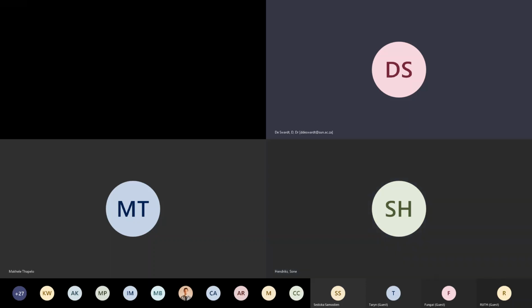No. It doesn't really play a role. No, or settings, keeping settings constant. I guess, again, it comes down to even if you want to do it in light microscopy, so normal bright field microscopy, yes. If you want to do any quantitative analysis, it is important that once you've found out what is sufficient for imaging, you keep the light intensity and the exposure time of the camera the same if you want to compare a lot of samples with each other.